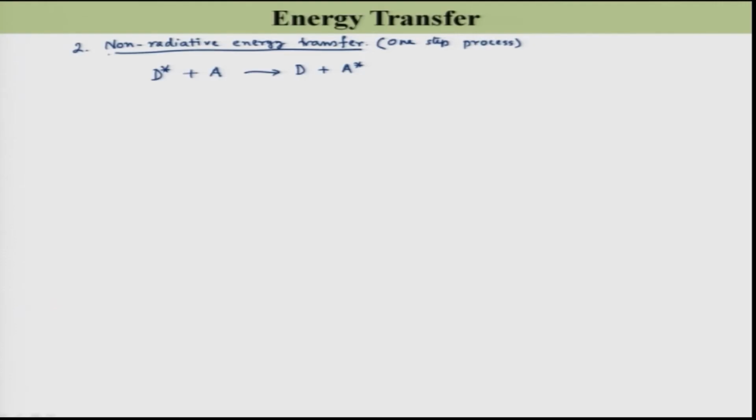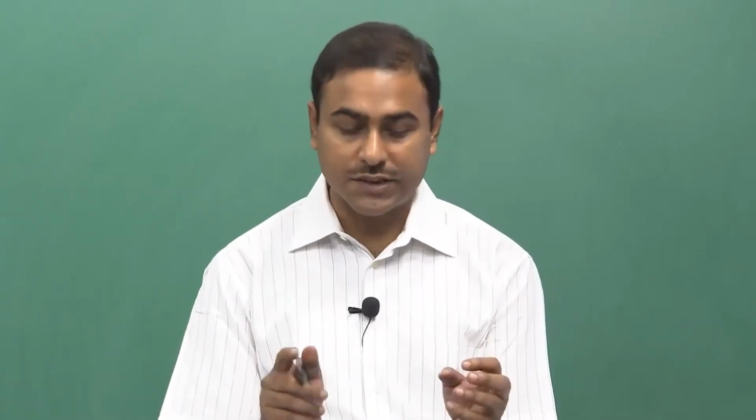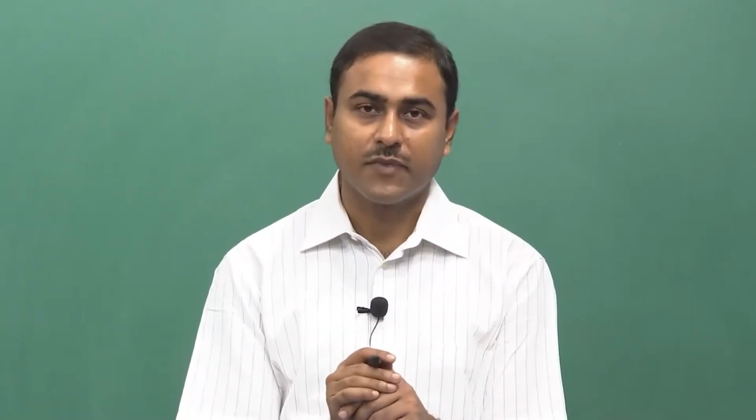Now, obviously, I have to discuss what are the variables on which this non-radiative energy transfer depends.